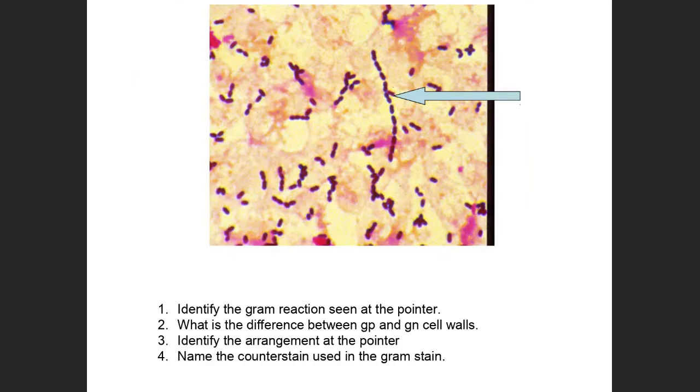All right, let's talk about the review. Appreciate the slide. You're looking at these particular structures that are staying purple. On an exam, I will always tell you what color it is if it's not discernible. If I think there's any way that it might be a little bit pinkish or reddish, and there's not an exact color, then I will tell you. Here, there should be no mistake that it is purple.